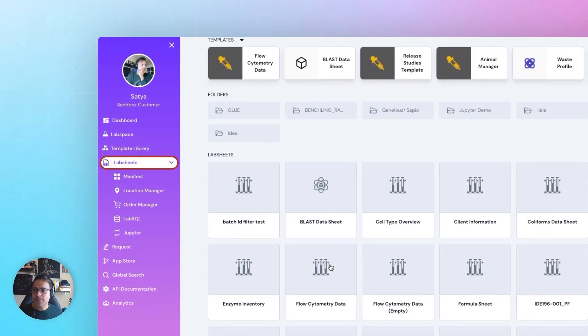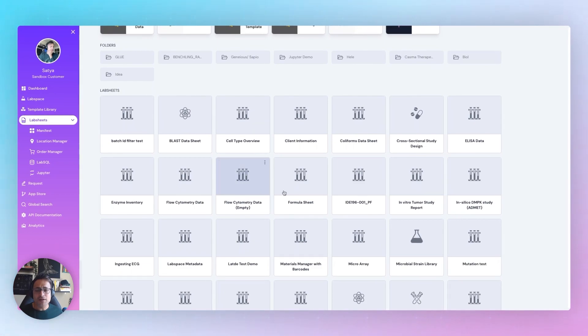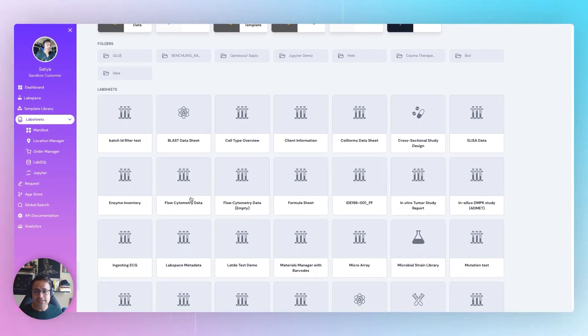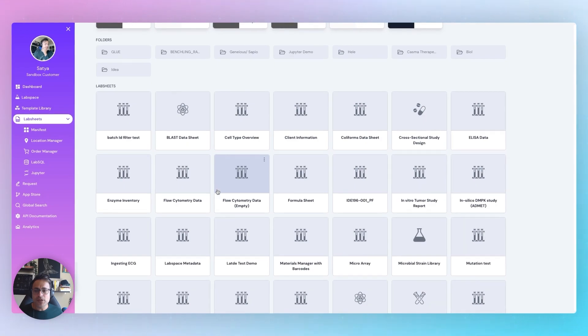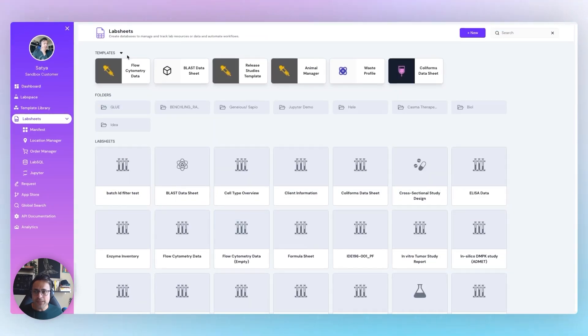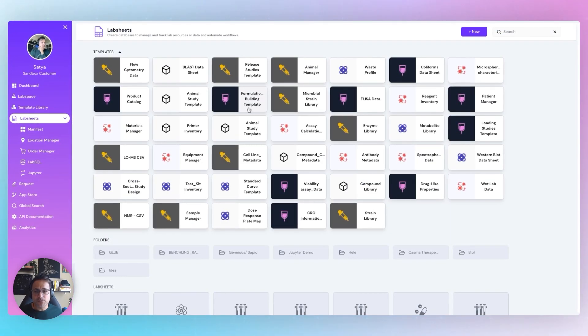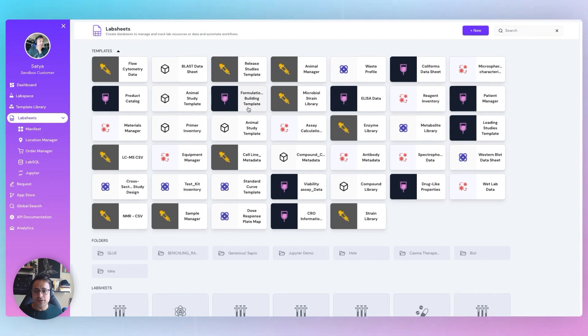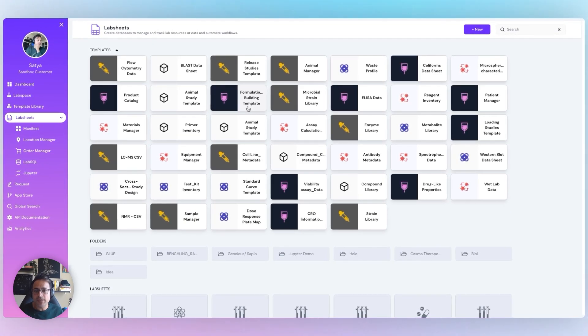Next, there's LabSheets, our configurable database product to manage your lab inventory, samples, or data. Use our library of templates to design these databases from scratch with our no-code configuration, or even create them programmatically.